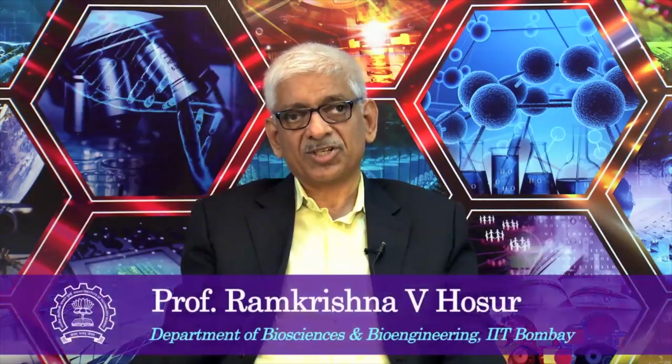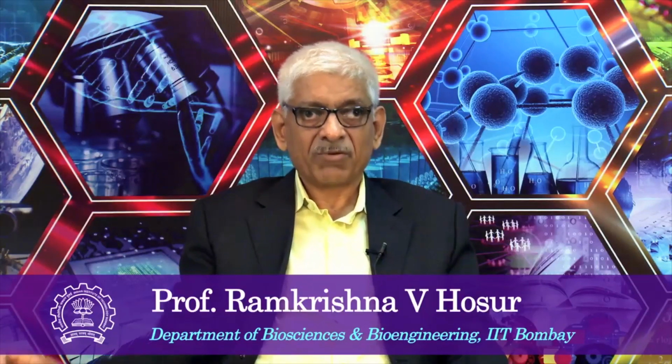but the principles which you have learnt from the 2-spin system are sufficient to calculate the complex fine structures in complex spin systems. And we also showed how the patterns of the cross peaks can be affected by the relative magnitudes of the coupling constants, and the cancellation of the peaks can occur if the resolution is not enough along the T1 axis, and typically this will be the situation because you do not have enough increments along the T1 dimension, because of the limitation of the experimental time. That will be a disadvantage, and one has to get over these disadvantages by making improvements in our experimental sequences. I think we will stop here and we will continue with the developments later.